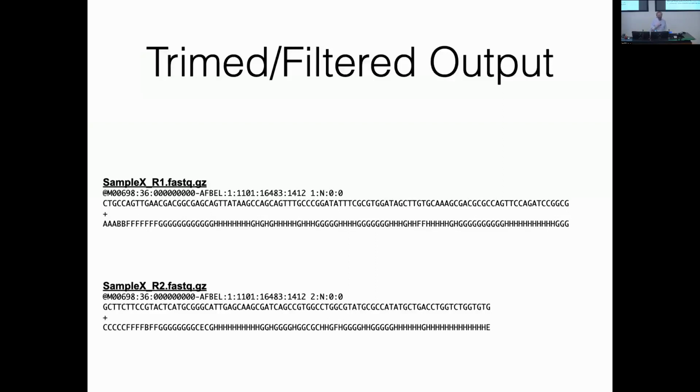For RNA, it's a little bit different because if you do have a very small transcript, like insulin is really small. I think insulin's 100 amino acids or something like that, right? I don't actually know in humans if there are any introns in insulin, or if it's pro-insulin, because I think it gets processed. I don't know. Anyway, there's a little bit of a limit set by the length of the messenger RNA and things like that.